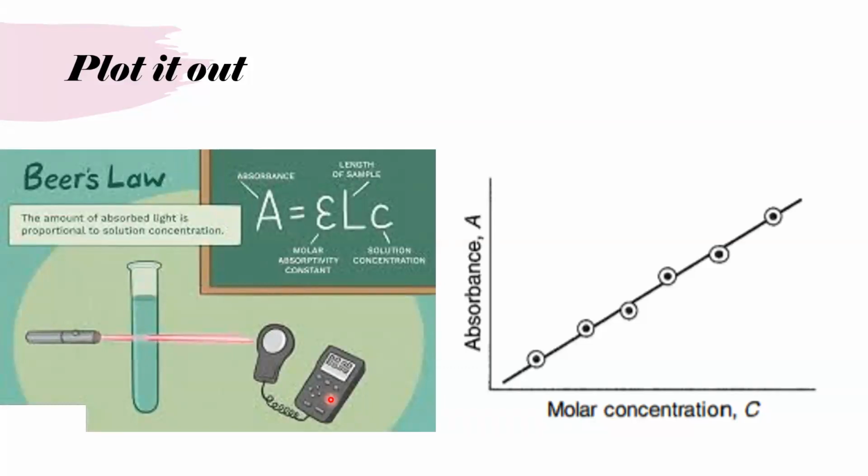And if one plots absorbance versus concentration, we should get a linear function, right? And then the slope and absorbance data resulting from that plot can be used to determine the molar concentration of the sample absorbent species in a solution of unknown concentration based on that linear relationship.